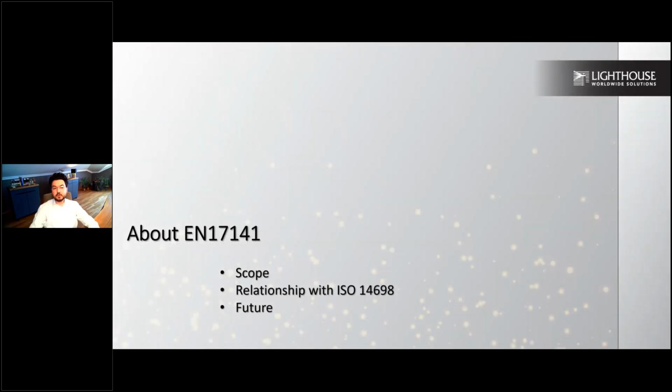Okay. First part, we'll be talking about the norm itself, the scope, and the relationship with ISO 14698, which is an international standard withdrawn from various countries, especially from the ISO perspective. And what is the relationship between this norm and the international ISO standard, and what's waiting for us in the future.